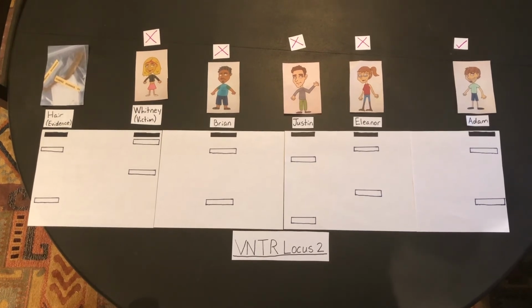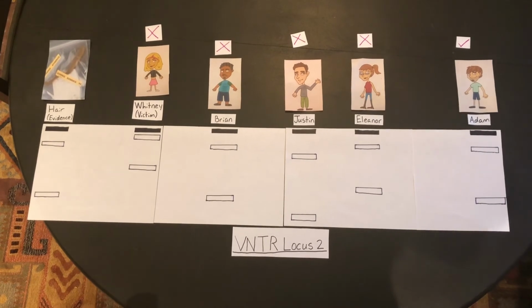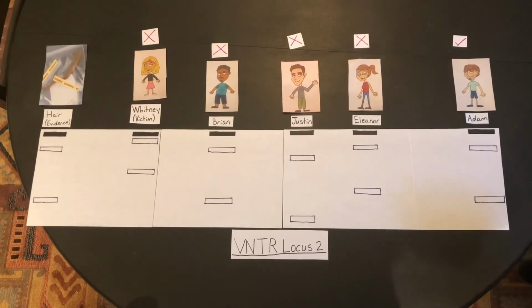Finally, for Adam, we did not exclude him in locus 1. In locus 2, both of Adam's alleles match at the same loci with that of the evidence. Since Adam matches all alleles and loci of the evidence, this means that he could be the culprit for Whitney's murder.